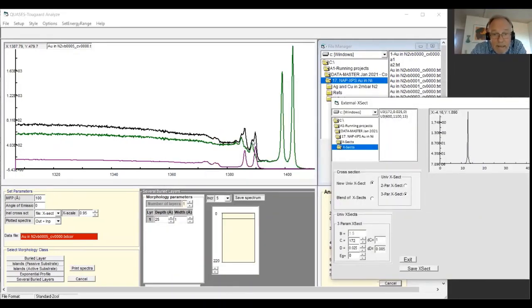Next peak is here, and this lines up with that peak, or it corresponds to that peak, because we have the 2 peaks here. So we have these 2 here from this and that. This one will give rise to a peak over here as well, corresponding to these 2 peaks. So we now line up the last peak with this position. So we need to increase this. Let me put in a 5 again here, so we go out, and we have it about here.